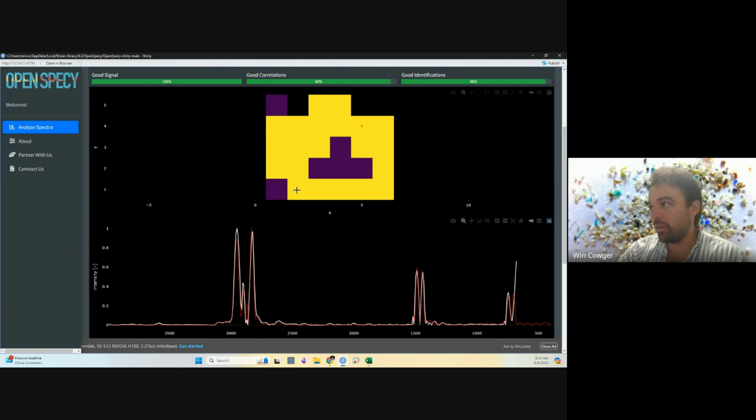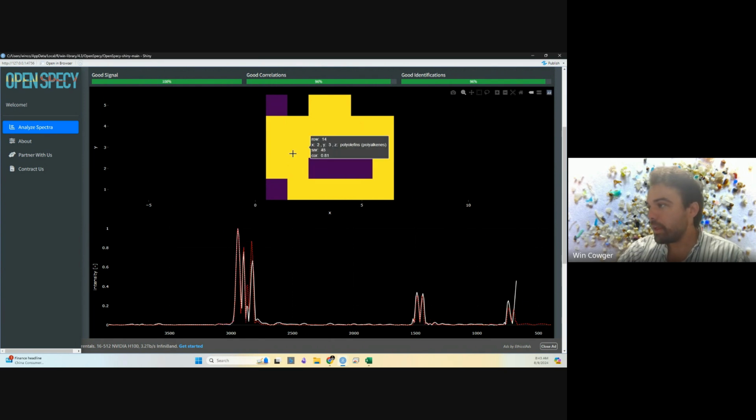That's classic. Some of these that are coming up as other plastic, sorry, other plastic is a class that we use as a catch-all, because there's a lot of plastics that are hard to categorize. So somebody sent me this polyethylene with like 50% additives or something. And I don't know, should that be in the polyethylene class or in the additive class, or how do we categorize that? So we throw a lot of things into the other plastic.